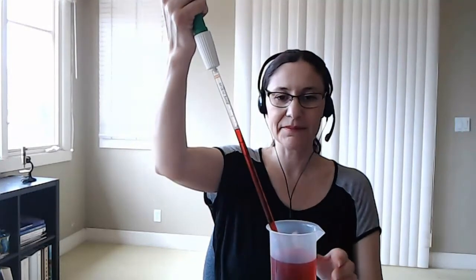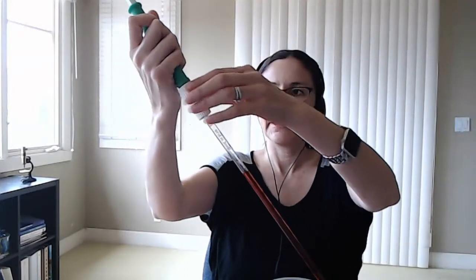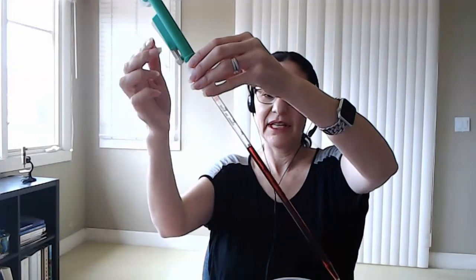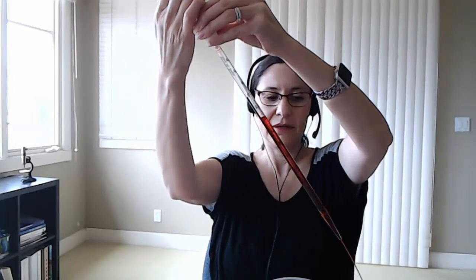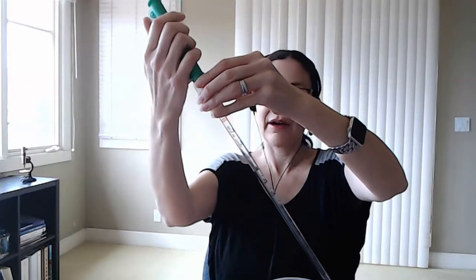There are two different ways that we would deliver our solution to our other container. In our pipettor, there is this button here that if I push it, watch what happens. This one right here. Do you see what's happening? It is releasing the fluid. Now I would just roll this back down.